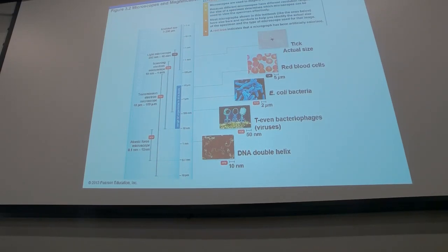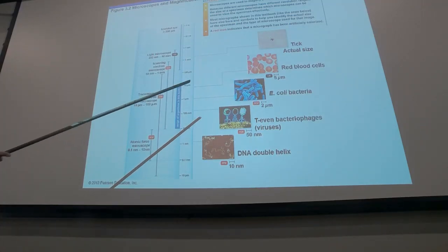You want to measure me side to side, you use the same scale, and of course you start with the 0 here, and then my side to side will be kind of 42 centimeters. So that's why you use these bar scales in here.